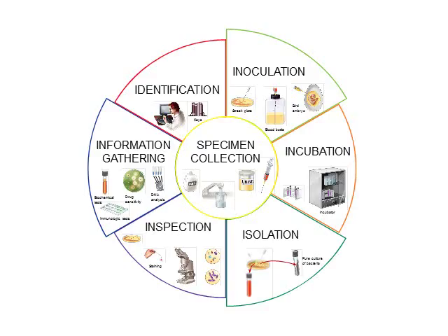So just to remind you, here are our 6 I's of microbiology. We're not going to go into a lot of detail on each of these. You can actually find them in your book to help you finish with your homework packet. So we kind of focused on the inspection part and information gathering a little bit and identification in the previous part. So now we're going to be looking at isolation techniques and inoculation techniques as well. So looking at how to isolate colonies and how to actually inoculate or use different types of agar to grow your bacteria or your specimen that you collected.